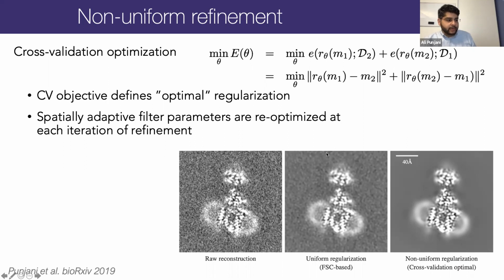Similarly, in uniform regularization, which is based on the common techniques that we mentioned before, FSC, all parts of the structure are treated the same. So we've removed some noise from everywhere that was commonly present across the board, but there's still lots of noise left in the background, lots of noise left in the membrane micelle. Only the protein structure looks a little bit cleaner than before.